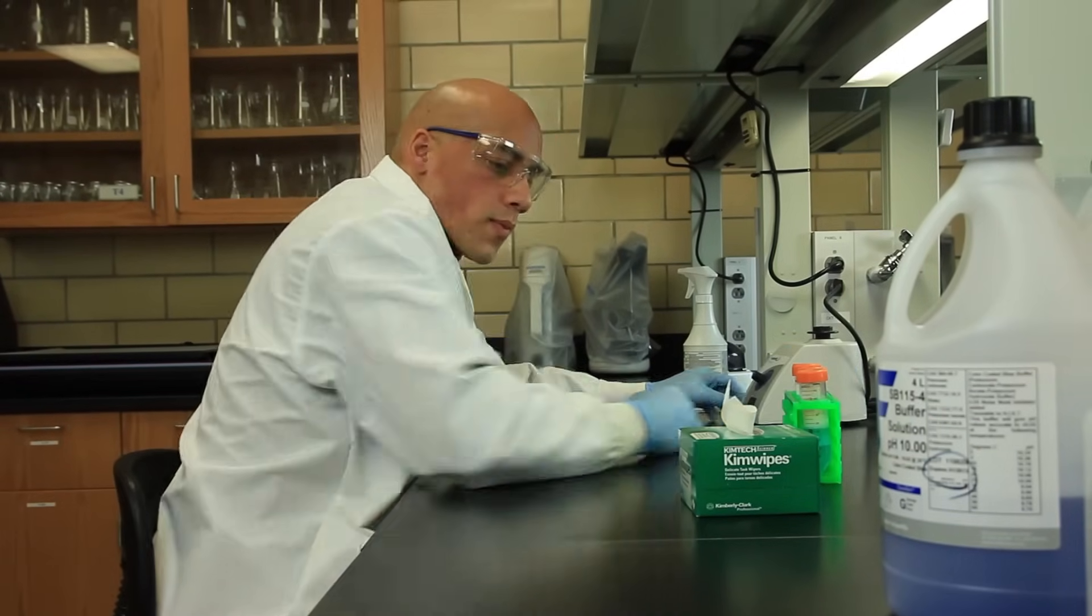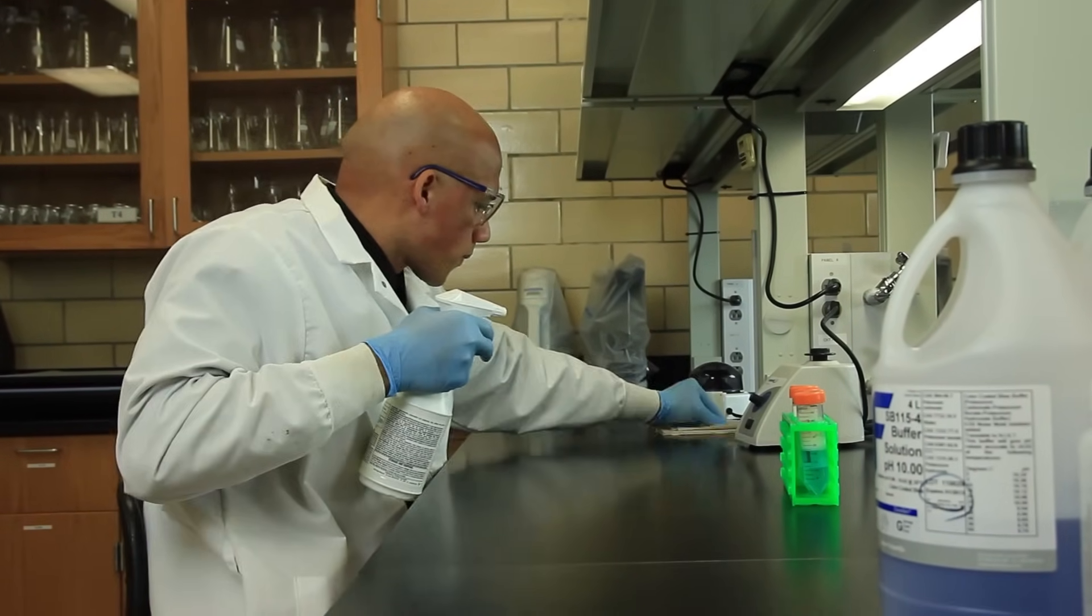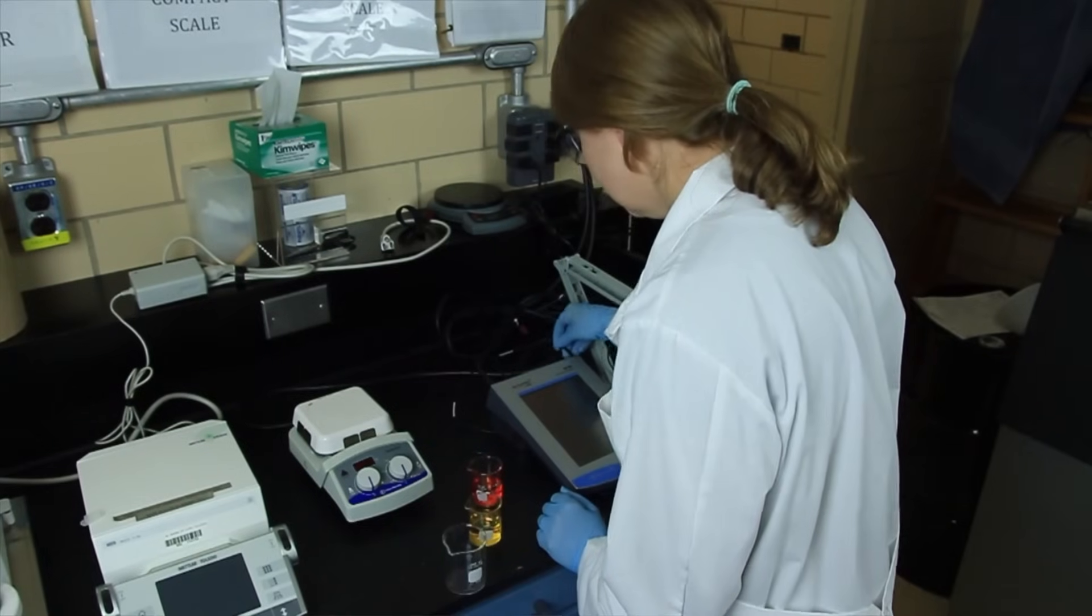Keep your workbench clean and organized. Have only the materials you need. Store away all unneeded items. Don't place materials near the edge of the workbench where they can easily be knocked off.